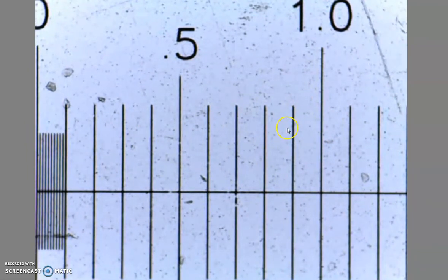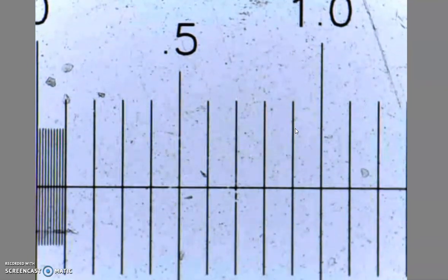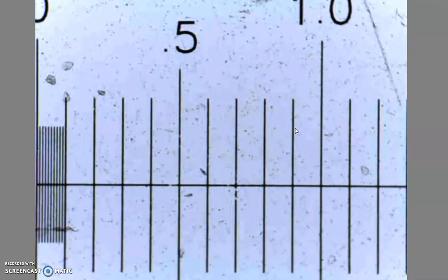So you're going to measure at 10x, which is what we're looking at here, and then you're going to do the math to figure out 4x and 40x using the equation that's on page 18 in procedure 2.3 in your lab book, and you're going to be filling out the table that's on page 19. So just to give you an idea, right now we're at 10x, right?